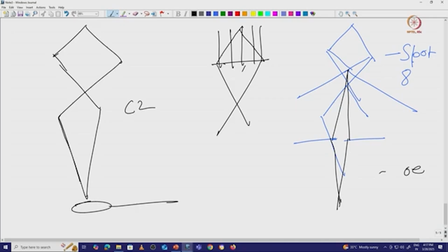If we make the beam focused on one particular point, is this a good idea, to control your C1 lens current and C2 lens current in such a way that your electron dose falls on your sample or is focused on one particular position?